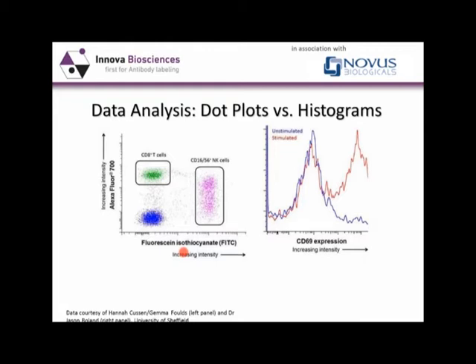In this particular experiment we used an antibody to CD8 labeled with Alexafluor 700, and we used a commercial antibody mix which picks out CD16 and CD56 positive NK cells using FITC, and you can see quite easily that it's possible to identify defined populations on the basis of this profile. For example, you could put a region around this and then analyze those cells, or the phenotype of those cells in more detail, through a hierarchical system.